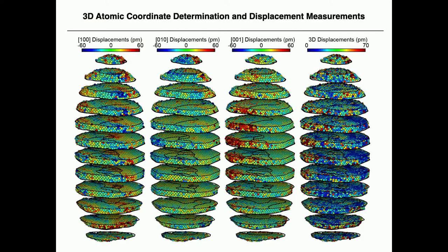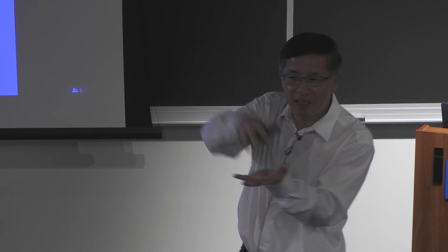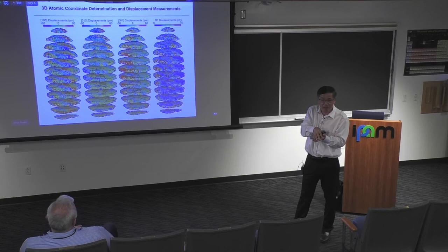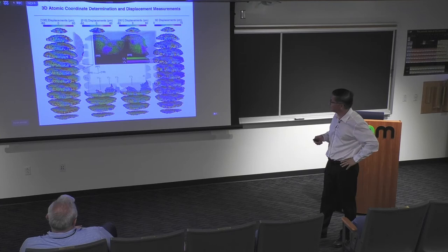Residual tensile or compressive effect from the manufacturing of the part? It's close, it's very close. So we put a nanoparticle on a silicon nitride membrane, a very thin membrane. It is a 5 nanometer thick silicon nitride membrane, and we put it in the electron microscope. So it turns out this side corresponds exactly to the side attached to the surface. So the interaction between the atoms and the surface can be detected with our precision. It's quite accurate, right? We later double checked that indeed this side corresponds.